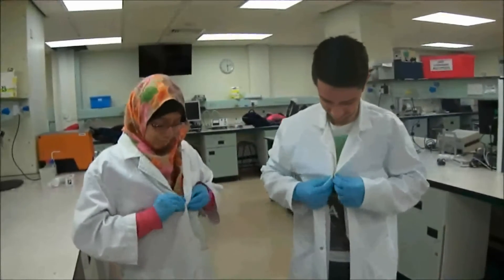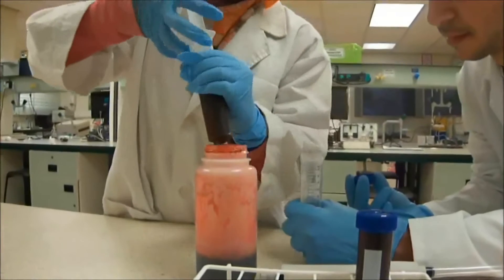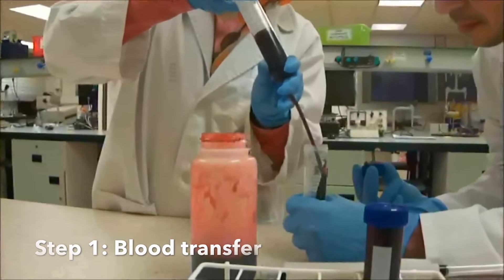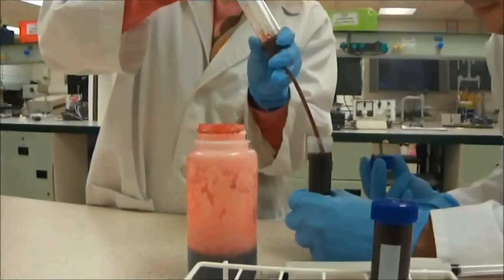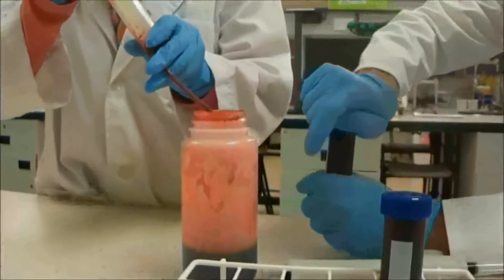For safety reasons, before carrying out the experiment, please wear your lab coats and your gloves. Begin the procedure by transferring a portion of blood sample into the centrifuge tubes using a syringe. Fill it to the brim. Remember to cover the tube tightly.